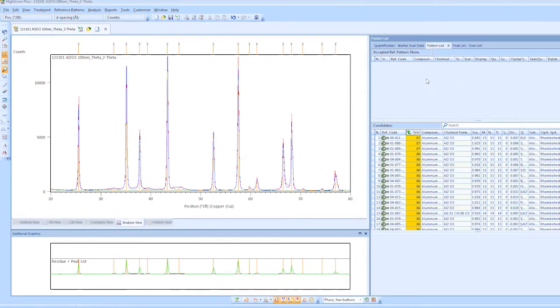Okay, sorry about that. So this is a score up here, okay? Typically the higher the score, the better, and that's what you're seeing here. Basically, it's all coming up as aluminum oxide, but notice that there's a lot of different aluminum oxides here.